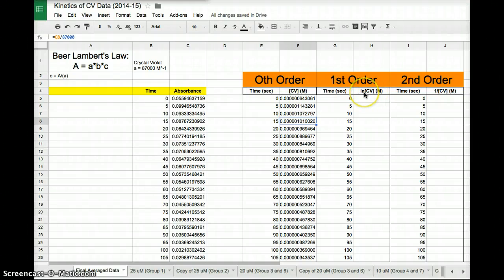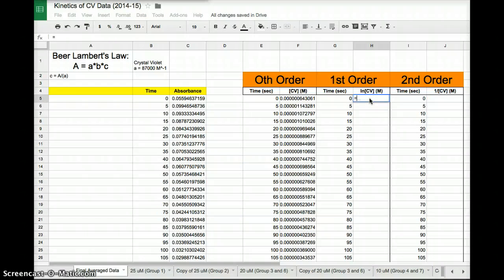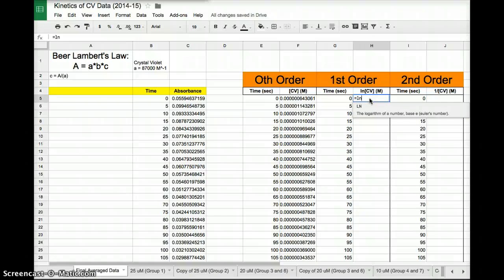Now let's go ahead and do the same thing for natural log of the concentration. So since these are the concentration values, I need to take the natural log of those. So I type in equals. Don't forget to type in the equals sign. You can't just type anything in right away. Otherwise, it doesn't know it's a function. And natural log, I'm just going to type in ln. And you can see it already pops up. It knows the code that that means the logarithm of a number.